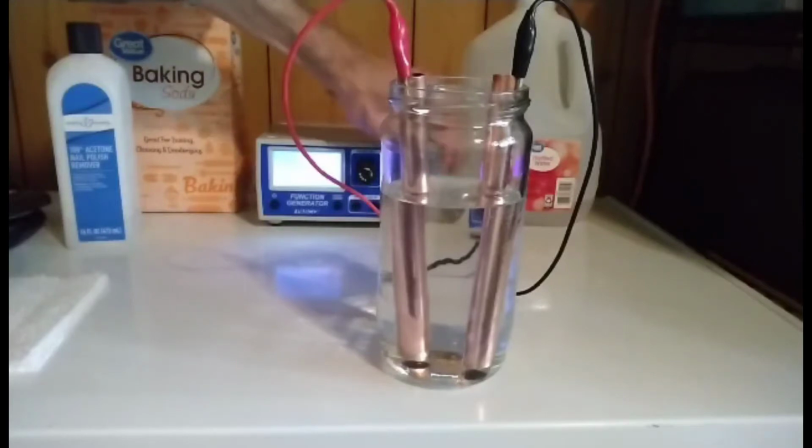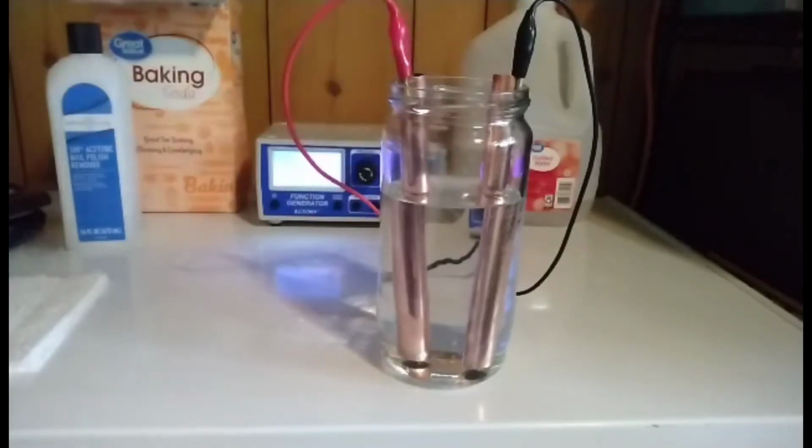Okay. Now what is going to happen is that the current will change as time goes on, because the conductivity of the solution is going to change. So you have to take a look on a regular basis and adjust the voltage if you can. Now if you have batteries, you can't adjust the voltage, so it's okay too.